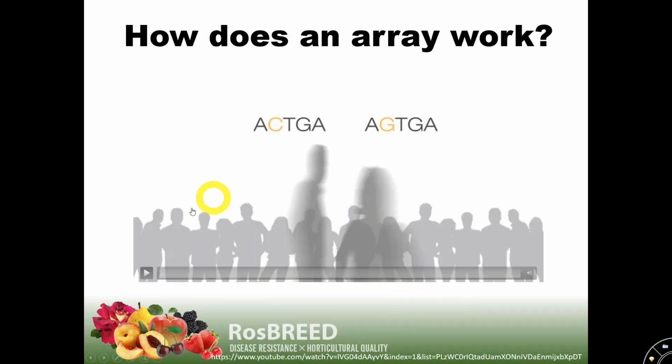And so I have a quick video from Illumina to show how the array works, so that again you have an understanding of where our data is coming from. I'll show it now.